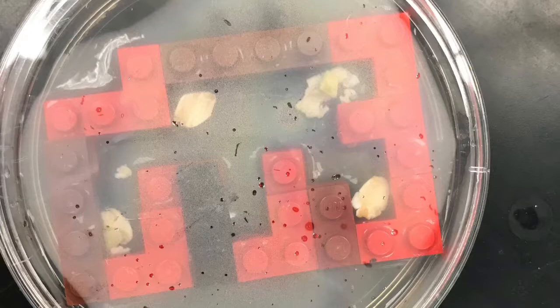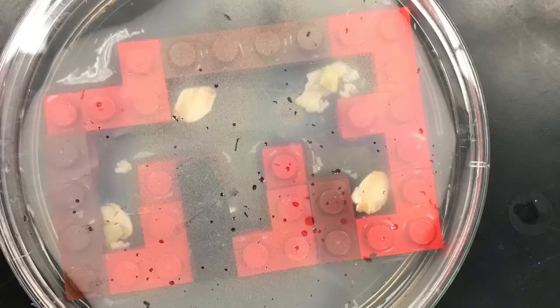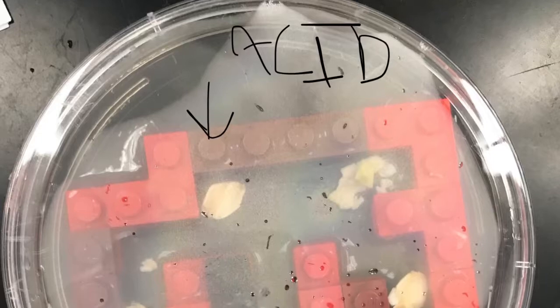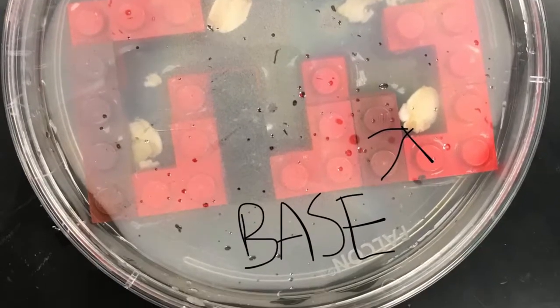For the next stage, we added 2 independent variables to the experiment, 0.1 molar hydrochloric acid and 0.1 molar sodium hydroxide. The dependent variable in this stage remained outward growth.